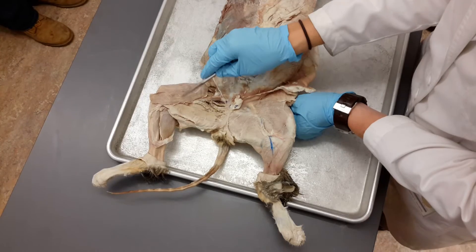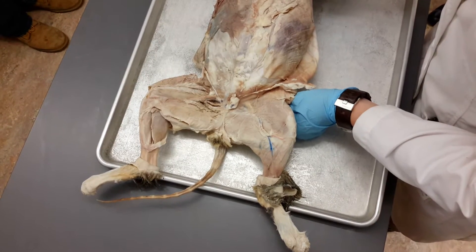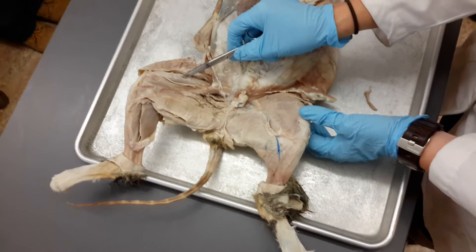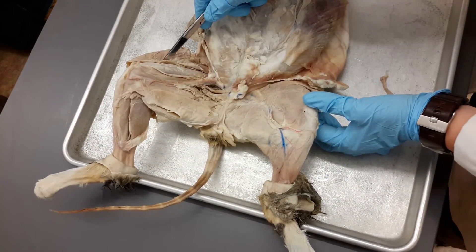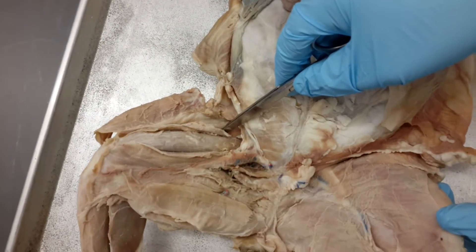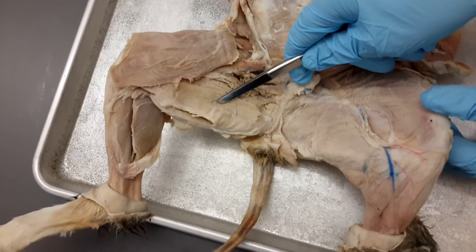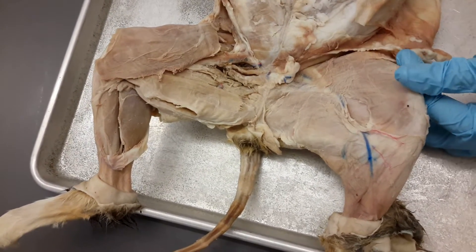Superficial: sartorius, gracilis. Under the sartorius are the quads. Once you know where you are, life is much easier. So once we know they're the quads, the middle quad muscle is the rectus femoris, vastus medialis, vastus lateralis. What is the tiny muscle — the pocket muscle? Tensor fasciolata. Small muscle with a long tendon.